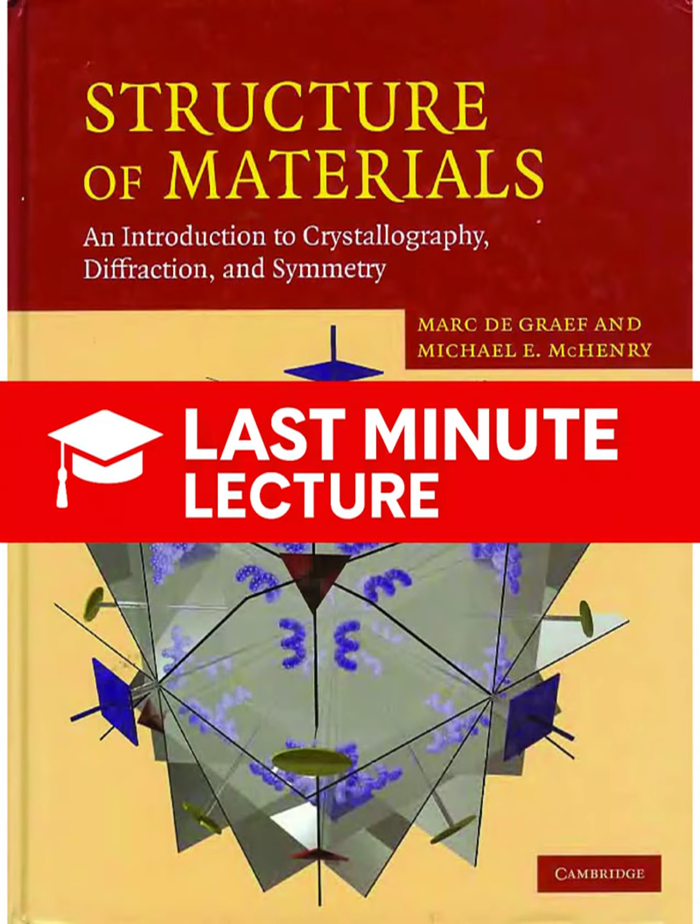And we showed how the Ewald sphere provides the necessary geometric visualization, translating the complex angular requirements of Bragg's law into a simple intersection condition in reciprocal space. Right, and that visualization also reveals a fundamental physical limit on our resolution, the limiting sphere, with a radius of 2 over lambda. Finally, we applied all these principles to the practical methods. The X-ray powder diffractometer, which uses monochromatic X-rays and random crystallite orientation to efficiently measure d spacings for phase identification. And the Laue method, which uses stationary single crystals and polychromatic radiation to map crystal orientation and symmetry. X-ray diffraction truly uses the crystal's inherent order as the perfect measuring instrument.